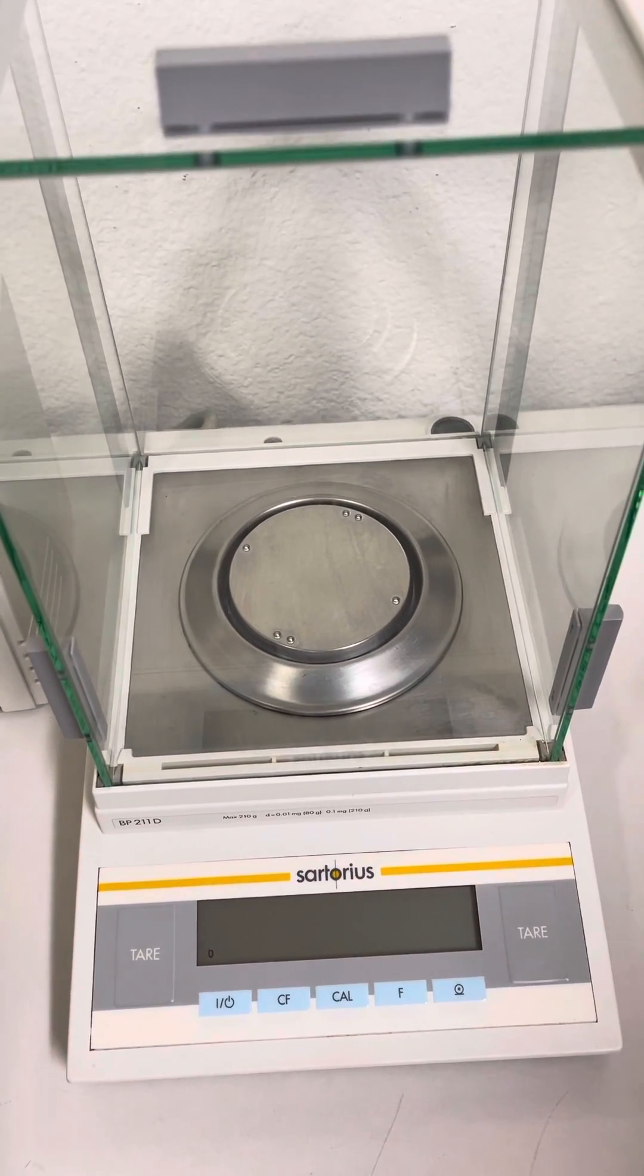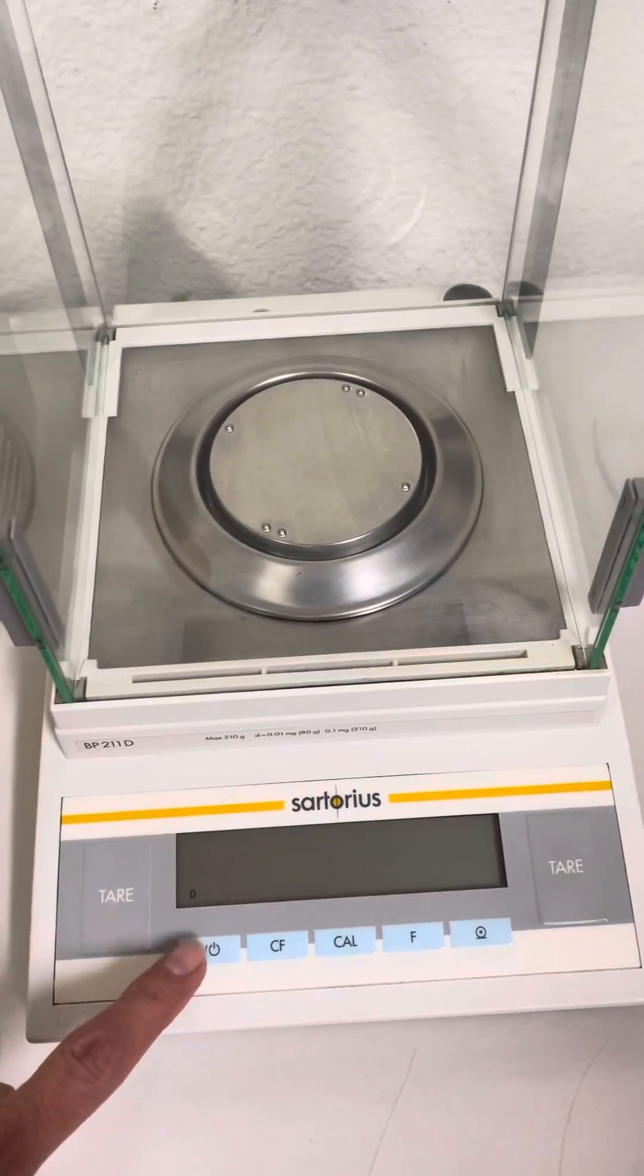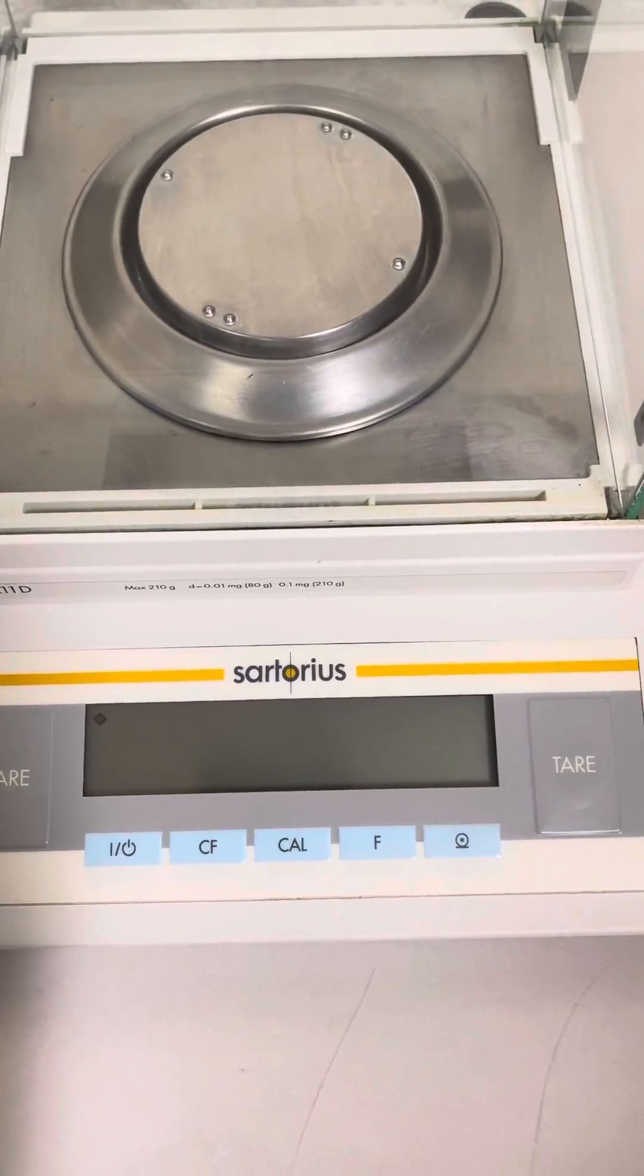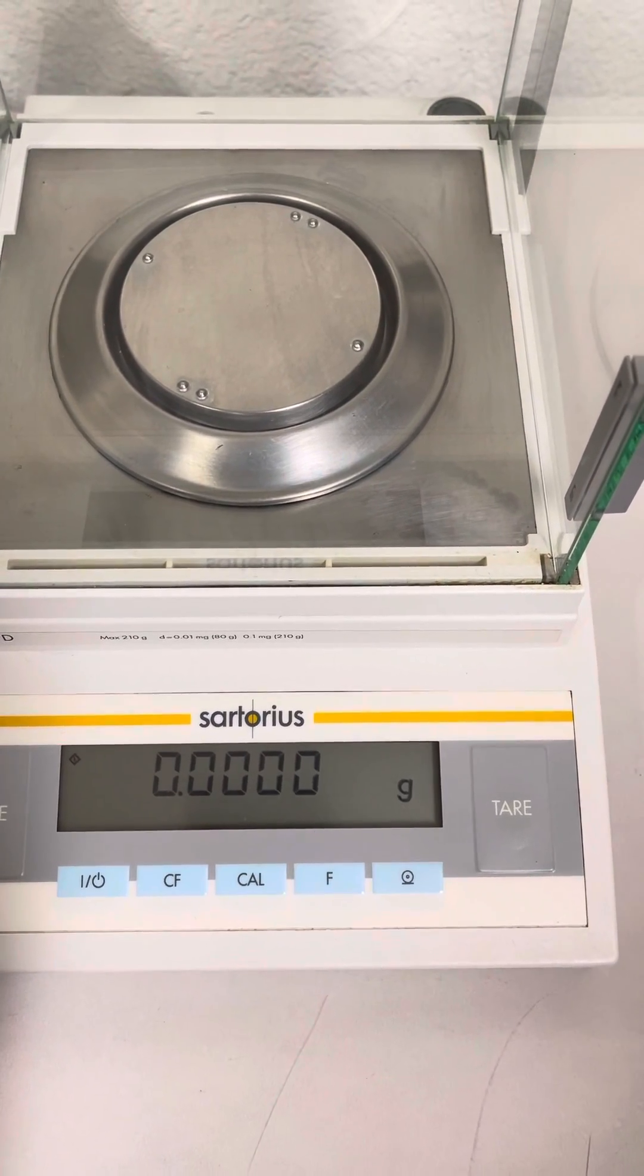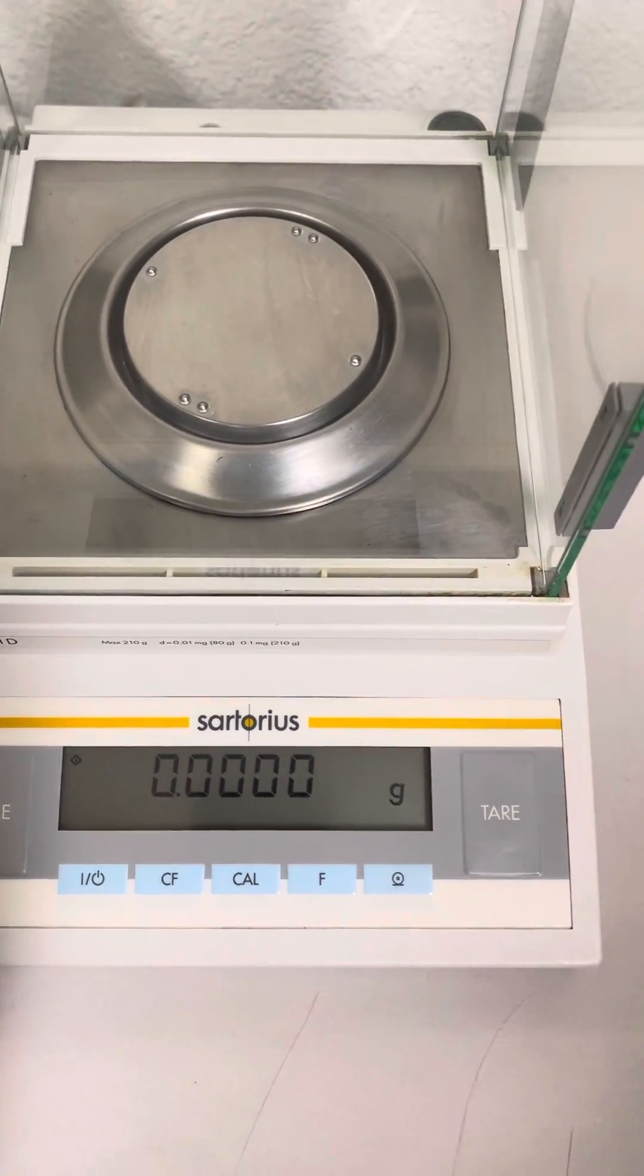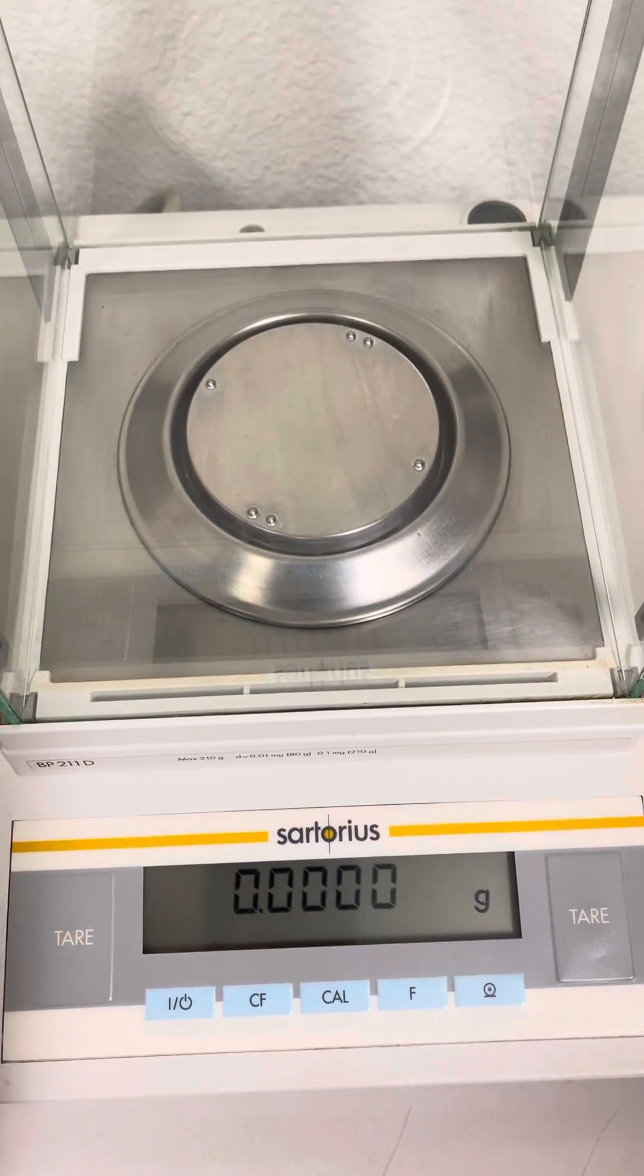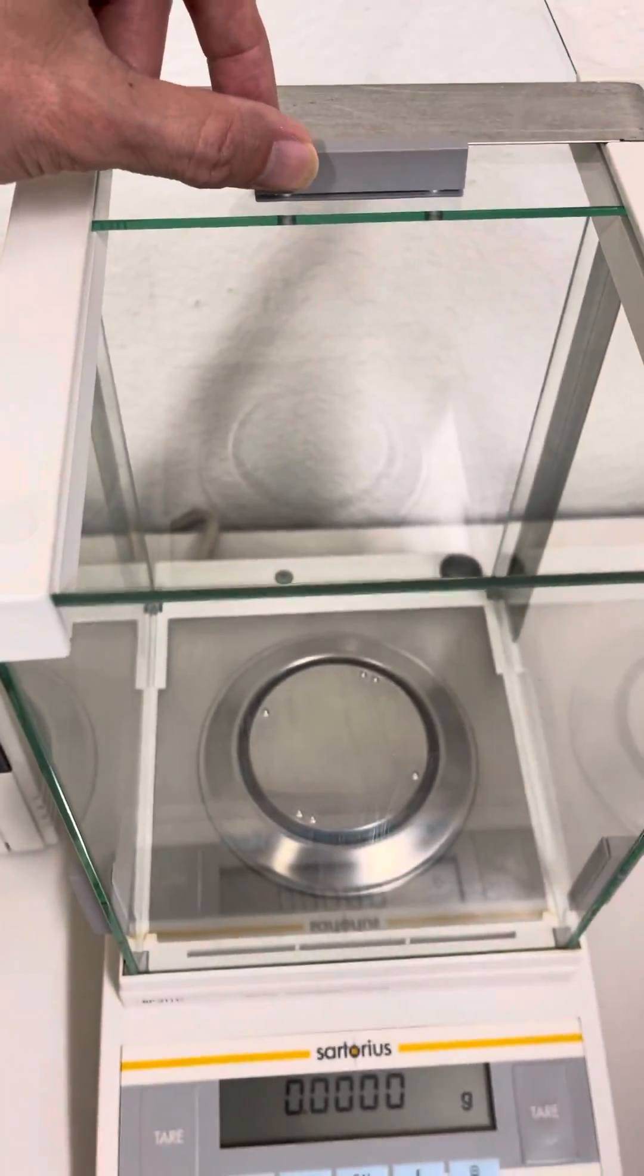Today is February 9th, 2021. This is a Sartorius scale. I'm going to open up one of the covers.